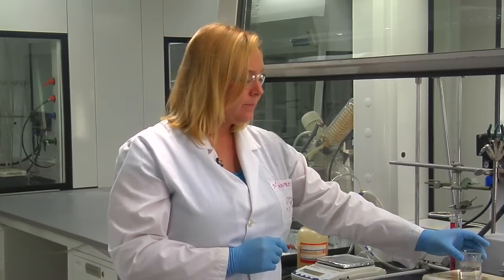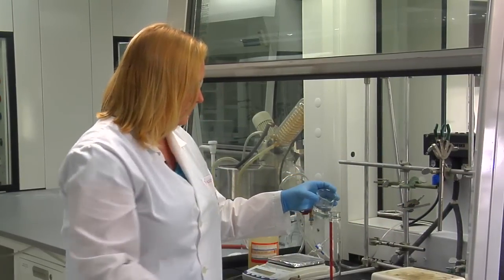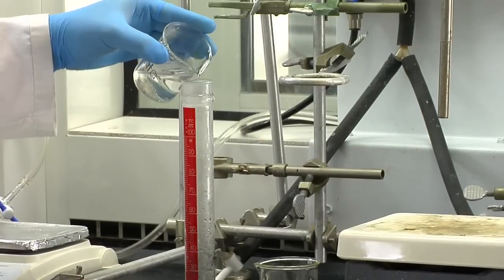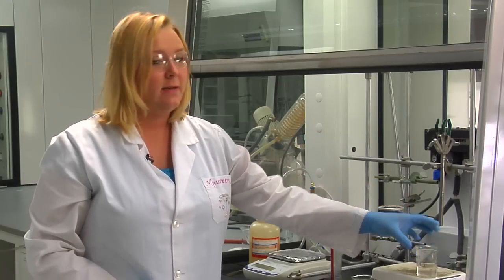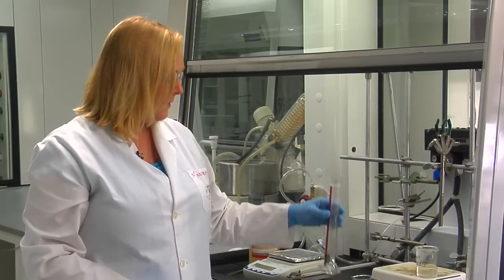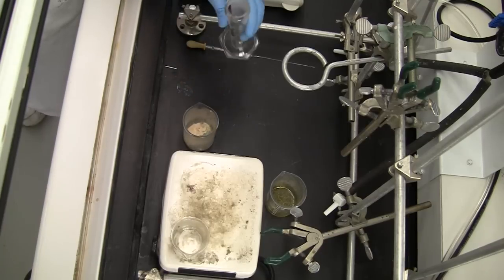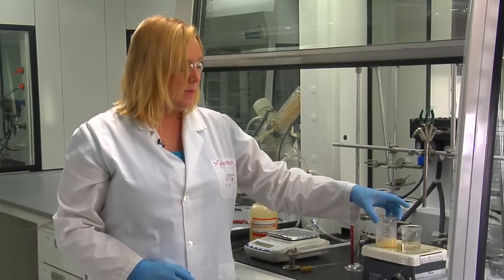When we're doing recrystallization, it's important to use a minimum amount of solvent. So we're going to start with only about 20 mils of hot water. When you're not using the water, you want to make sure that you keep it on the hot plate, so that it stays hot. So we'll add this to our salicylic acid. And to help it dissolve, we're going to place it on the hot plate and swirl it.